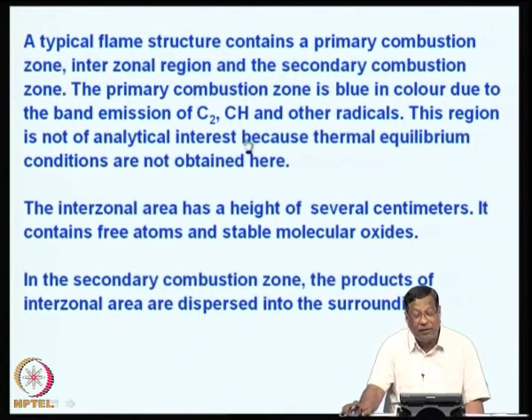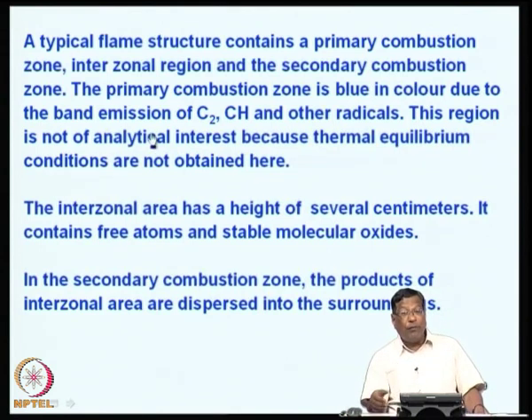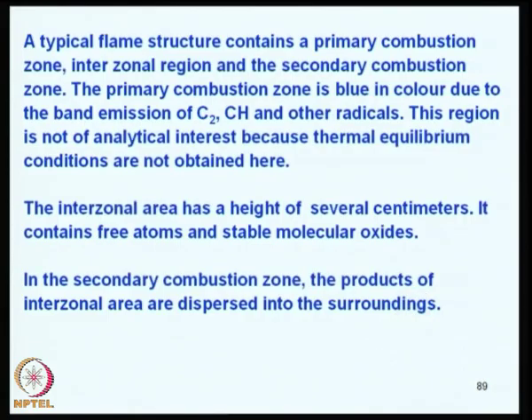The primary combustion zone is blue in color due to the band emission of C2, CH and other radicals.